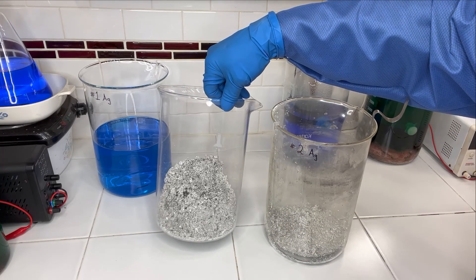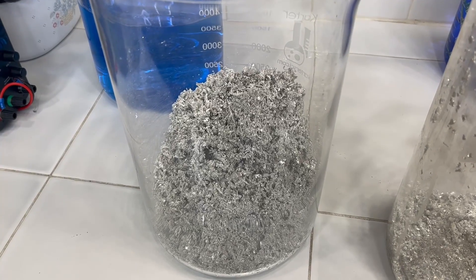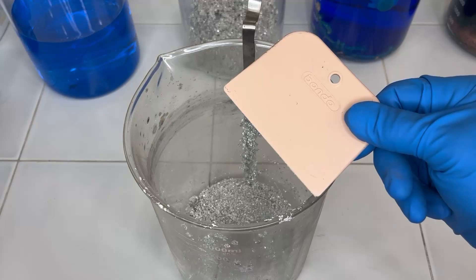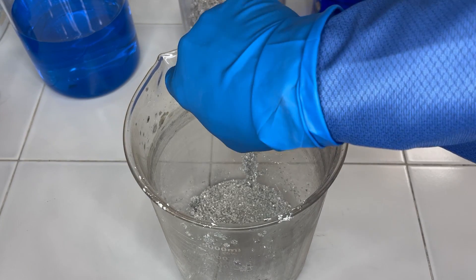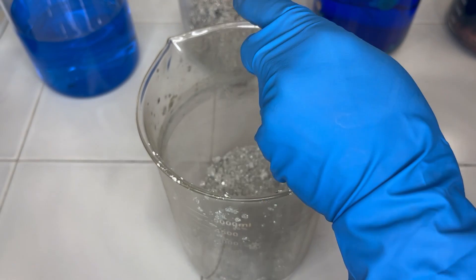I'll rinse the silver nitrate solution off of here and then we'll get a good look at it. Here I use a bondo spreader to scrape the silver off of the cathode.